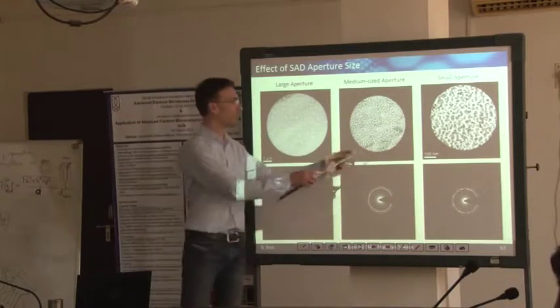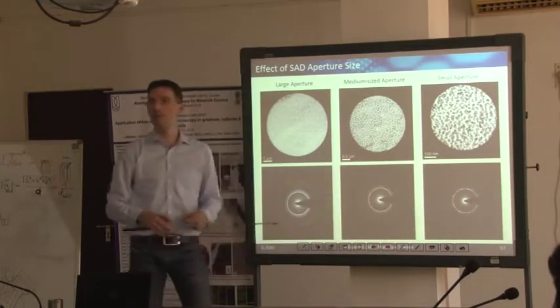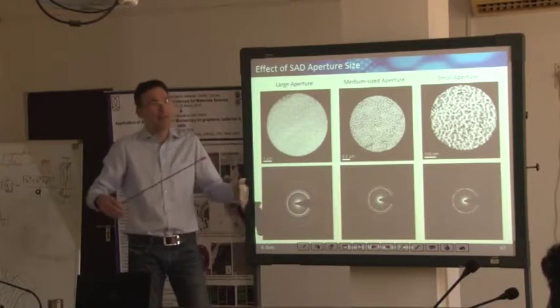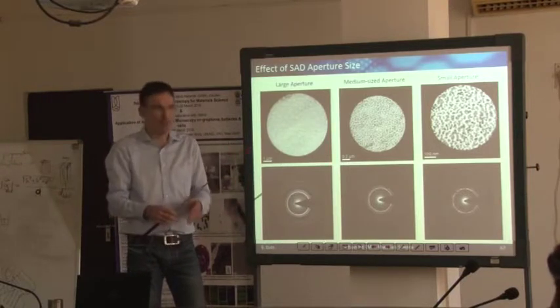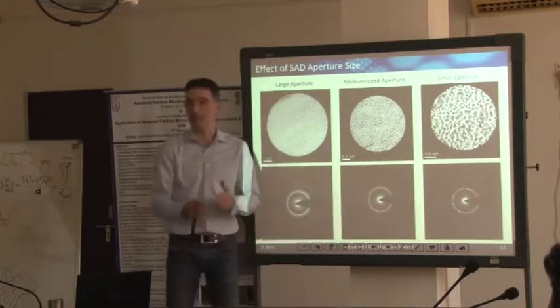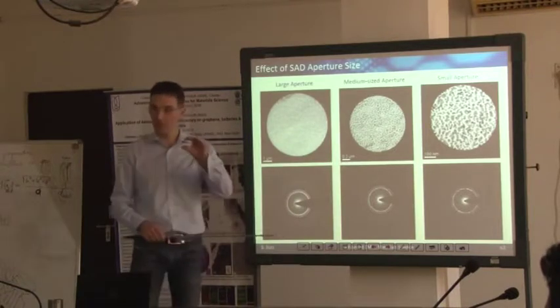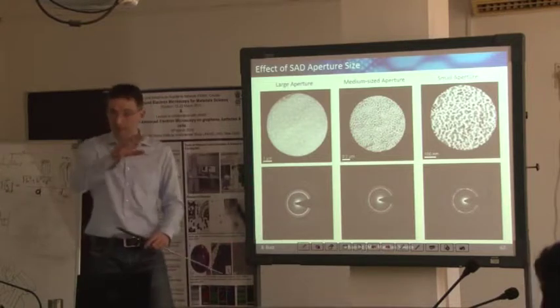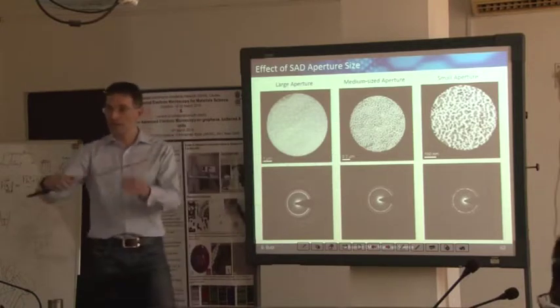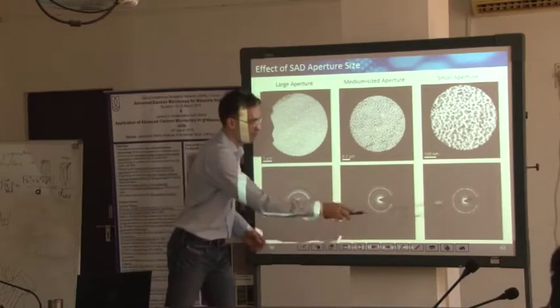And so you can even go down to smaller scales with sharp rings by just using a slightly astigmatic beam. If you focus the beam in one direction, at least you will end up with a certain convergence angle. And as you will see, the convergence angle will typically need to broaden. But by that, I could do a structure analysis of a pretty thin layer, let's say 50 nanometers, which was fine grained, just by averaging, integrating and superposing many such poor diffraction patterns.